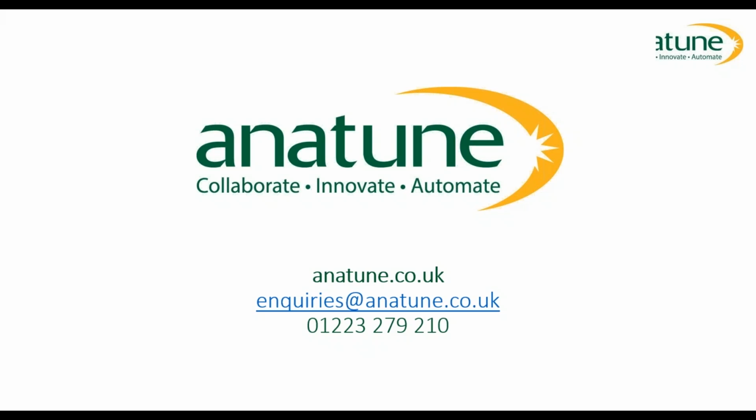I think one last question before we wrap up today. Could the high throughput provided by the SIFT-MS instrument be used to speed up method validation for conventional analytical techniques or methods? Yeah, that's an interesting question. I think it could. I'm very much a strong advocate for SIFT-MS, but I do all sorts of analytical techniques, and it depends on the method, of course.